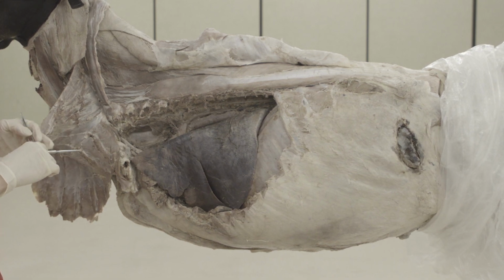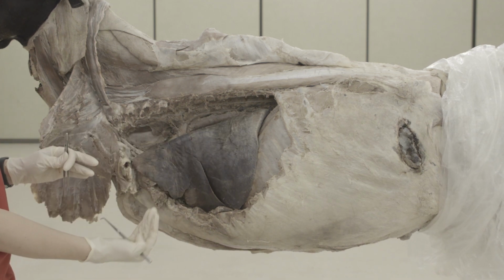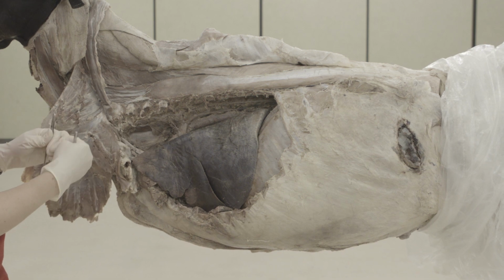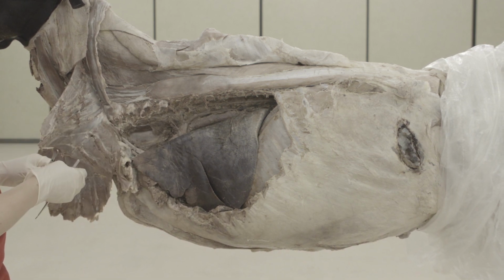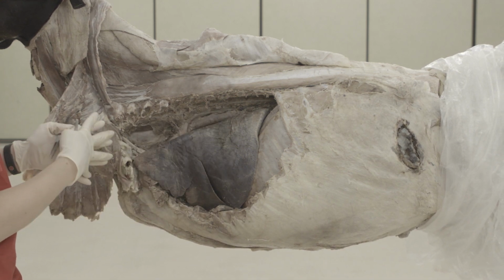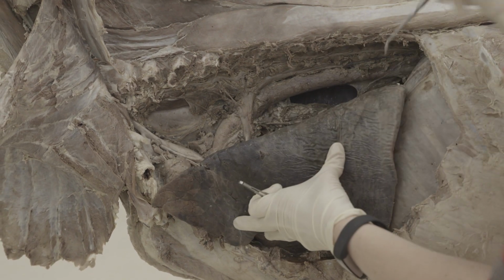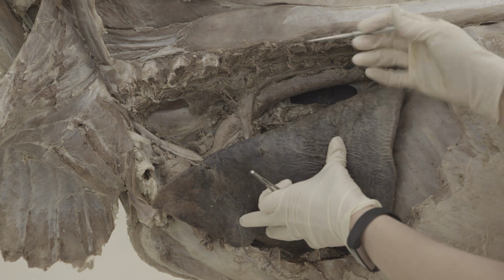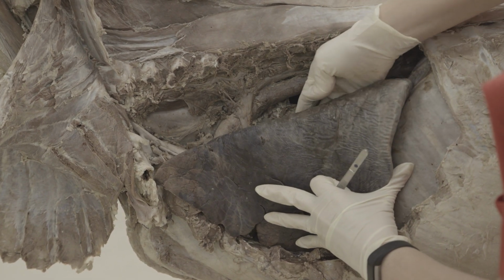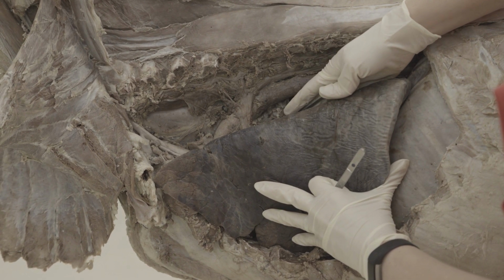So you're going to look at a few structures, or try to look at a few structures, by reflecting the lung and then removing it. But I'm going to, for demo purposes, remove the lung so that we can continue and just look at everything we can see from the left side. So we'll move in a little closer and take a look at that and take out the left lung. So the left lung, you'll want to kind of pull it out and see some of the structures before you take out the lung, because you're going to be cutting through the hilus. So the hilus is everything entering the lung here, but you want to make sure you're not cutting nerves and other important structures as you do that.